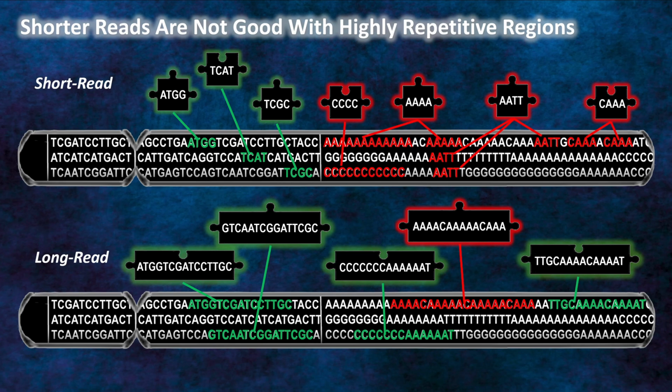You may have one or two of these reads that don't map well to a particular area, but the rest of it maps just as well as the rest of the chromosome, so you can cover those more repetitive regions with more quality, and you can align better in areas where you can't align as well with short read next generation sequencing. So that's one of the reasons that long read has the potential to give us an improved DNA testing capability that we don't have today.